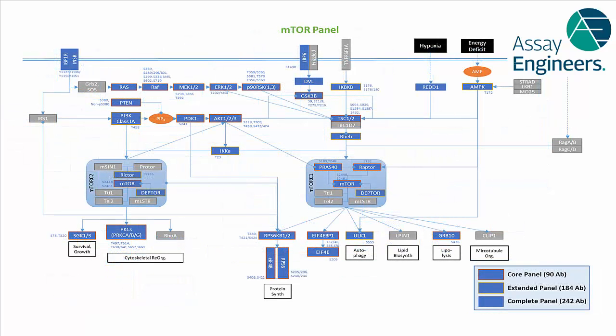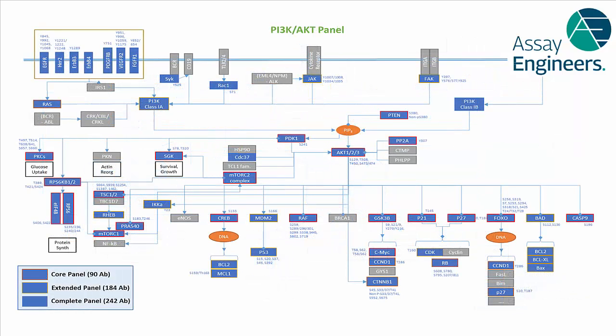If you are missing a marker relevant to your project, we can easily add custom markers and proprietary antibodies to your Hyperplex panel. Unlike other platforms, Hyperplex does not focus on discovering new, exploratory biomarker candidates. Instead, our platform makes validated biomarkers and a wide range of relevant pathway data easily accessible from a tiny sample.